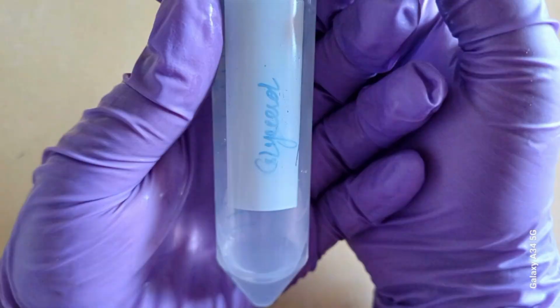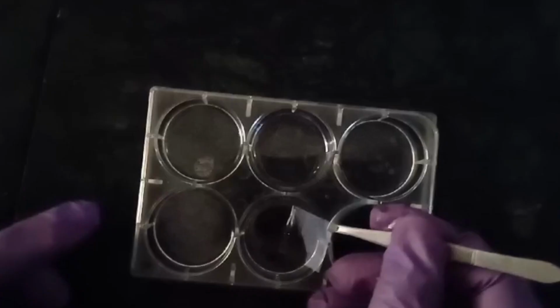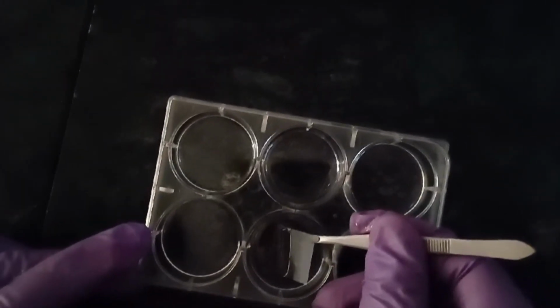Mounting can be done using glycerol or any other suitable mounting medium, and care has to be taken to make sure that the cells are mounted, or the cover slip is mounted with face down so that the cells are onto the slides, and this would make easy observation of the cells under the fluorescent microscope.